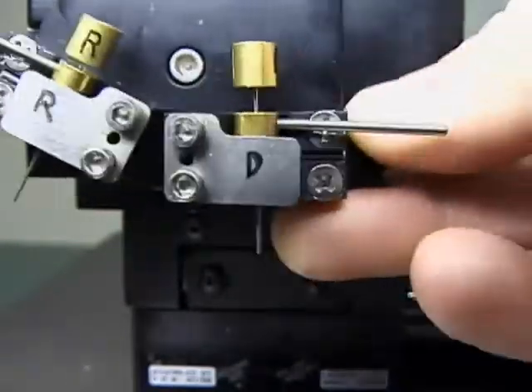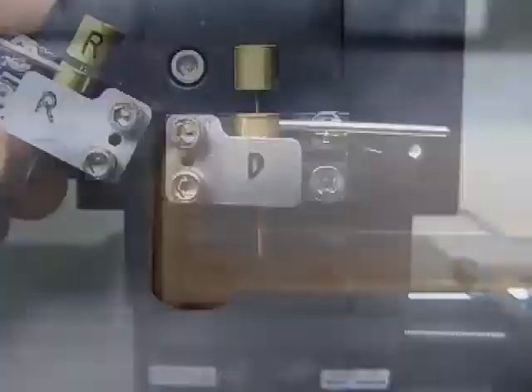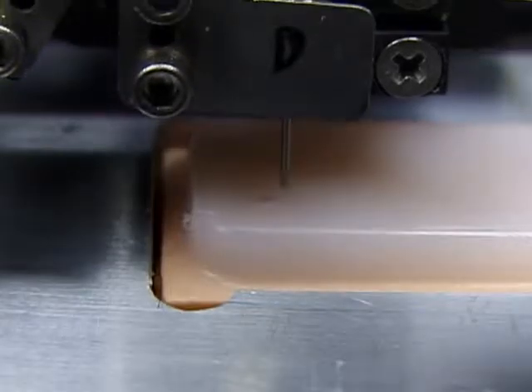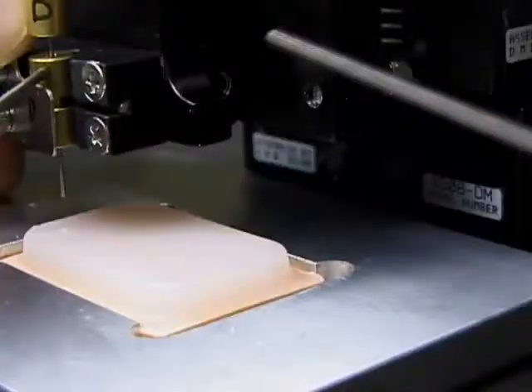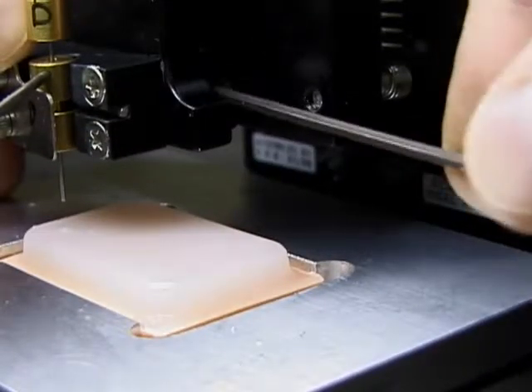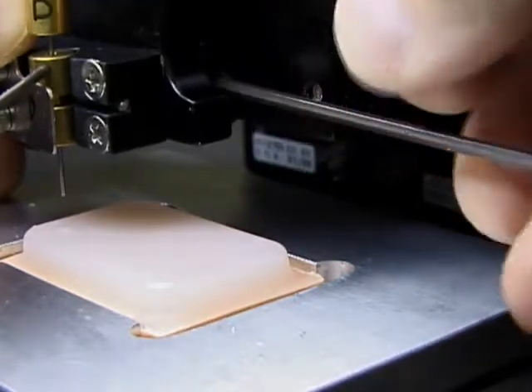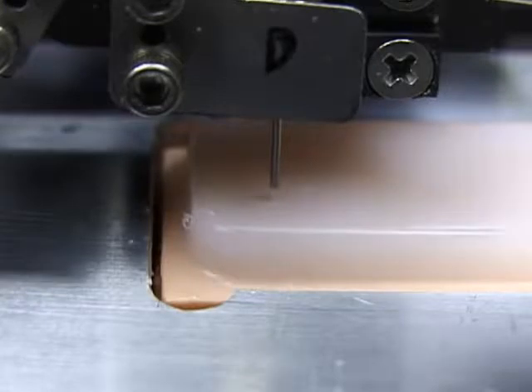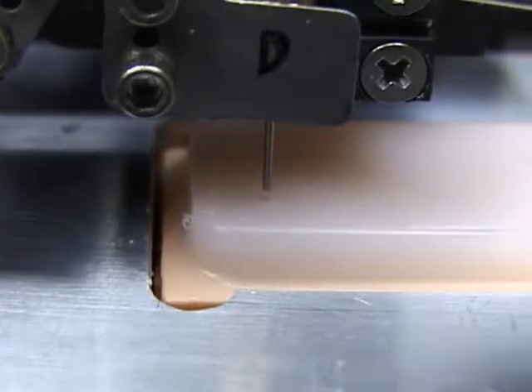Switch to the turret and lower the donor needle close to the hole. This donor needle needs to move to the left, so the adjustment screw behind the turret on the donor side is the correct one. Turn the screw until the needle lines up to the recipient hole.